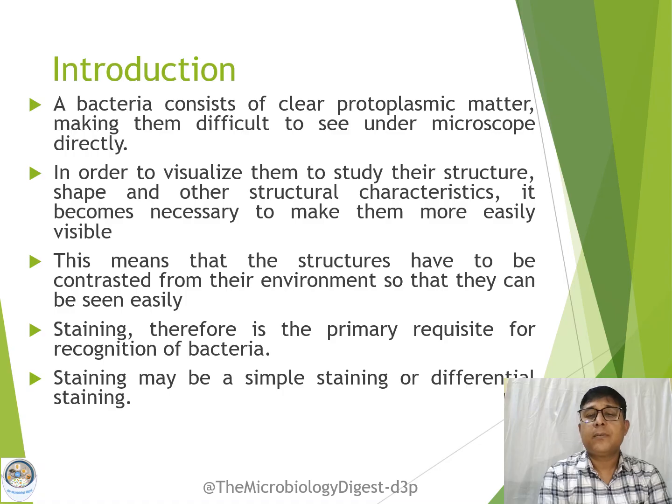So staining is a prerequisite. It may be of different types depending on the requirement and the purpose for which we are conducting our experiment. So it may be either simple staining or differential staining.